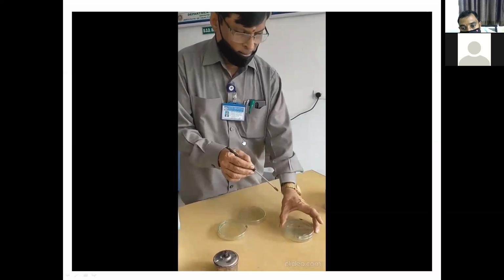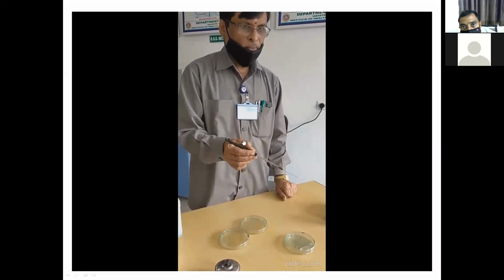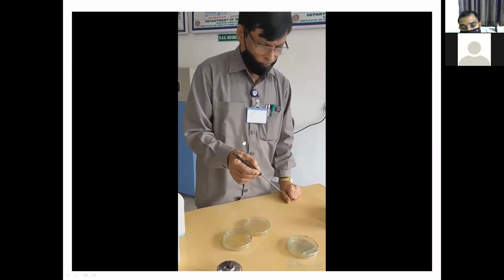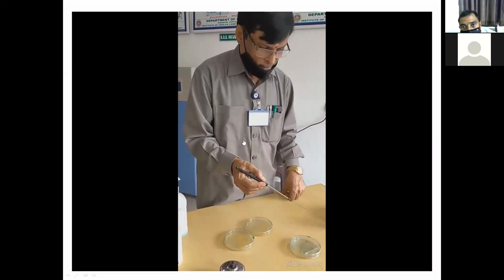All these we will prepare and keep in the hot air oven. We will sterilize them in the hot air oven, and before use we will take them from the hot air oven. We will start the technique.